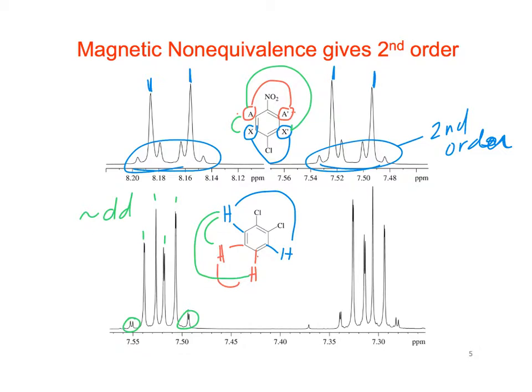So, in your experience, when you report a spectrum like this in the SI, do you usually explain it like that? Probably not. No one normally does that. They just call it a multiplet. Yeah, it might be a multiplet, because in reality, when you get these second order effects, the chemical shifts and the splittings are not actually what you measure right off the spectrum either.